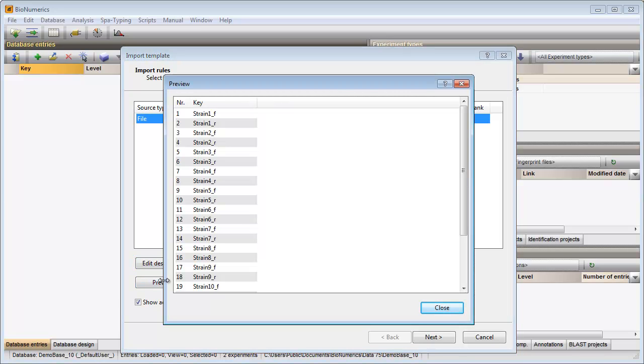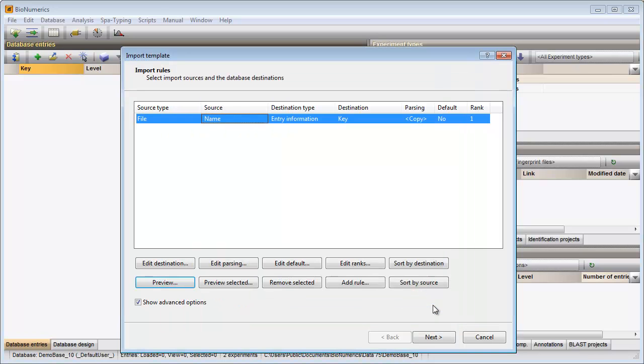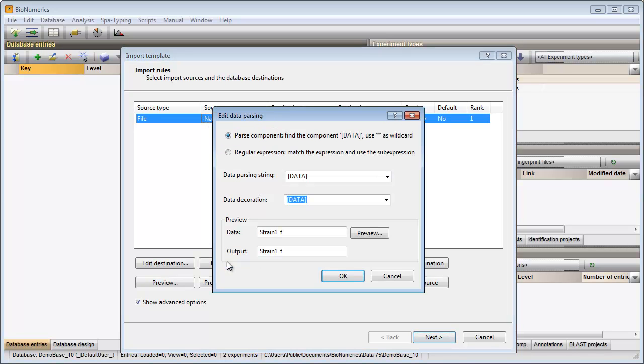From the preview I can see that not the complete file name should be linked to the key field, but only the part that appears before the underscore. Make sure the option show advanced options is checked, I select the row in the grid and press edit parsing.